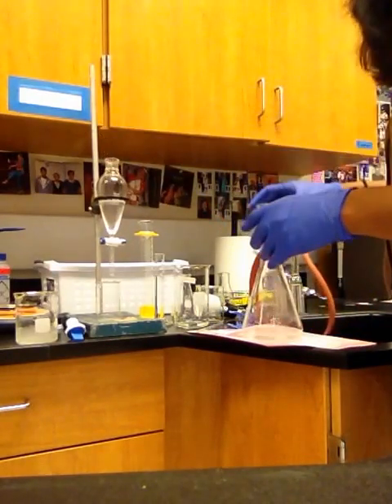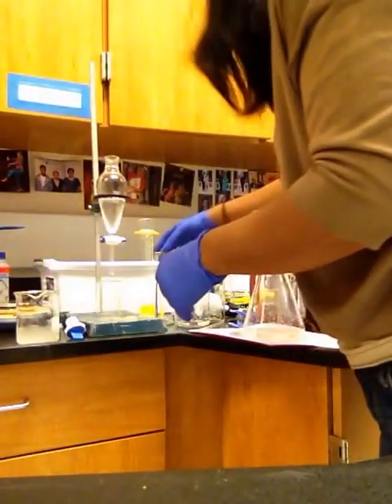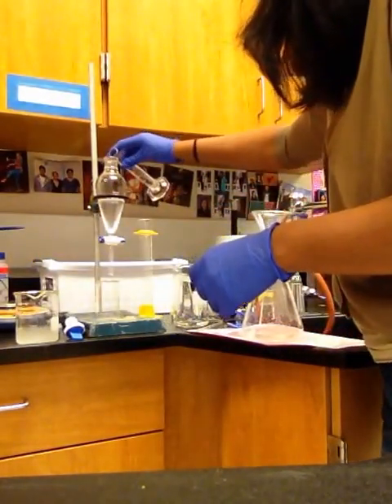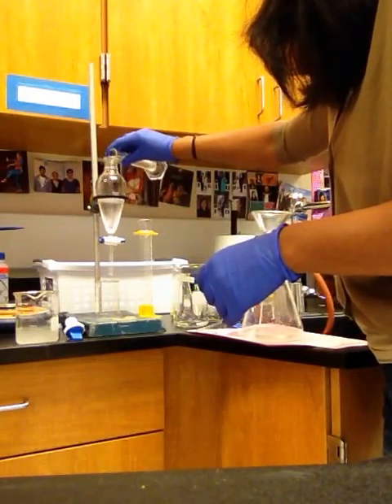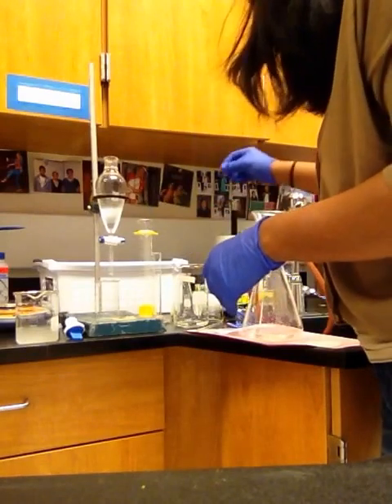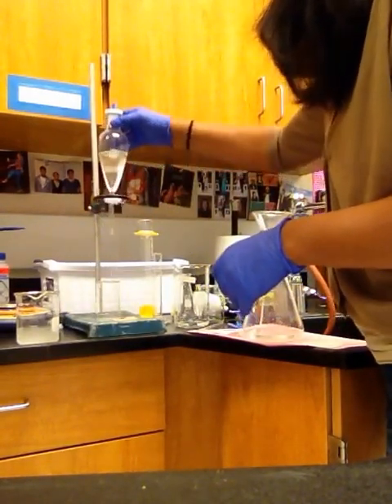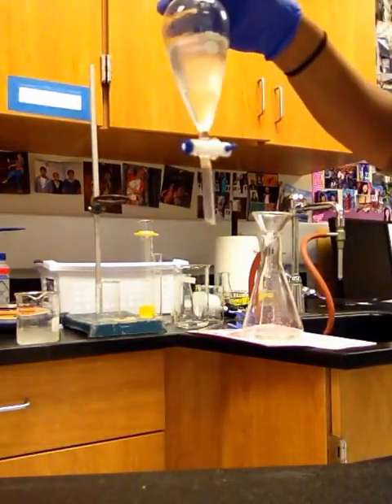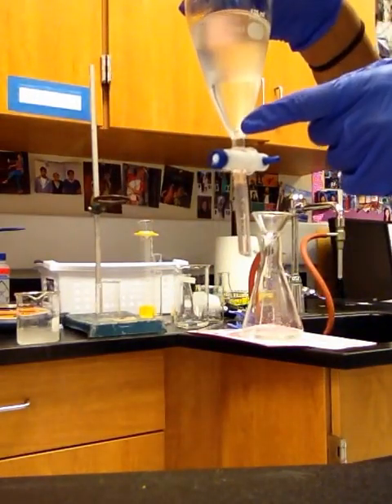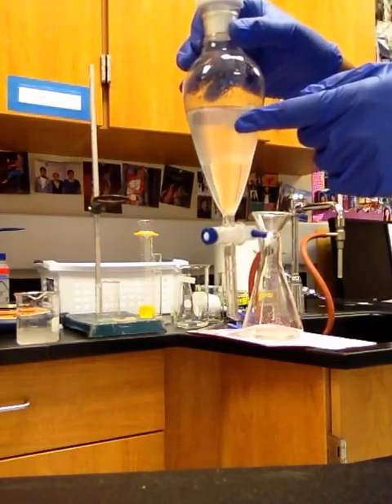Once you are done pouring it in there, you add an aqueous layer, which is NaHCO3. You put it in there, and you will see two separate layers are created. You close the separatory funnel, and you can see the two layers really clearly here. The bottom layer is the aqueous layer, and the top layer is ethyl acetate.